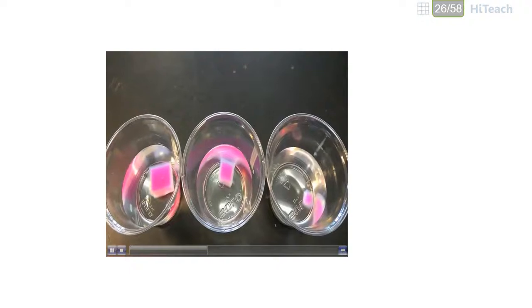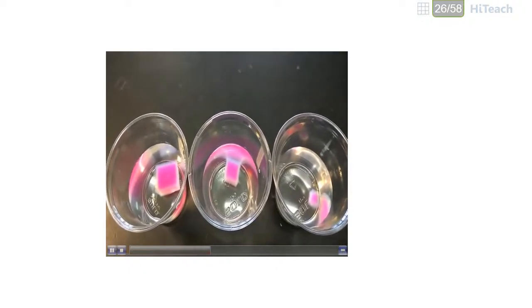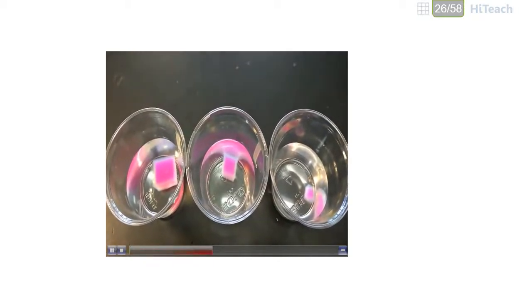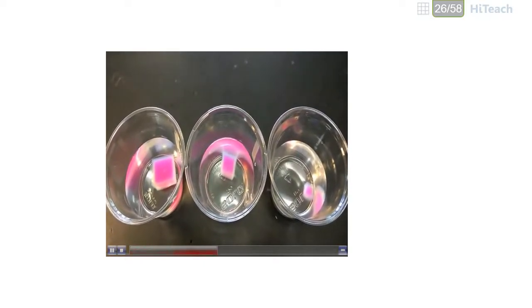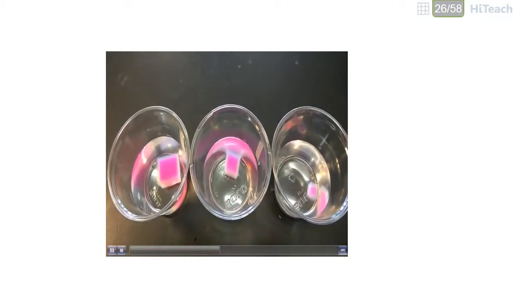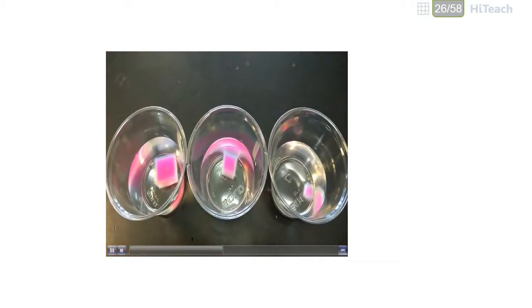About 2 minutes into the experiment, you can see that in the smaller cube there's only a small part that is still colored, and the larger cube still has a huge mass in the center that still has the phenolphthalein indicator in it, stained pink. So you can see the diffusion occurring much more rapidly in the smaller cube than in the larger cube. We'll revisit this in a few more minutes.